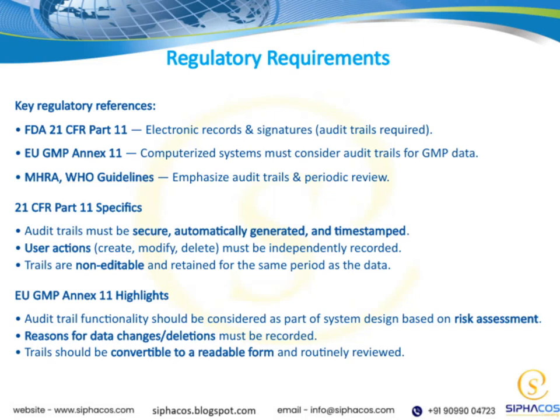Let's take a closer look at some key regulatory references that guide our approach to audit trails. First, we have the FDA 21 CFR Part 11, which specifically addresses electronic records and signatures. It emphasizes that audit trails must be secure, automatically generated, and time-stamped to ensure data integrity. Additionally, user actions such as creating, modifying, or deleting records need to be independently recorded to maintain transparency. Importantly, these trails are non-editable and must be retained for the same duration as the data itself.